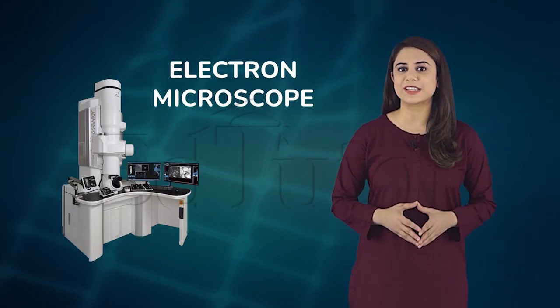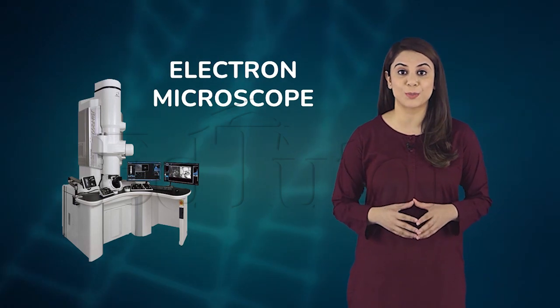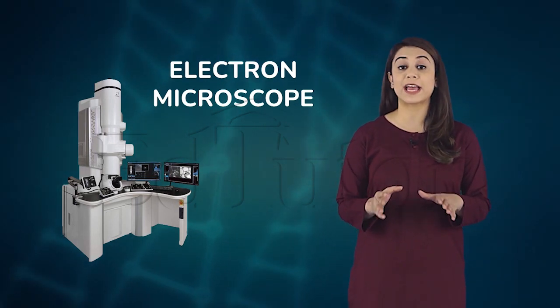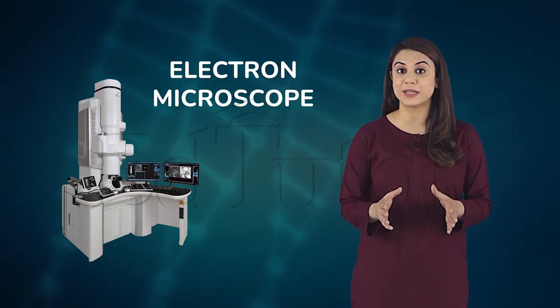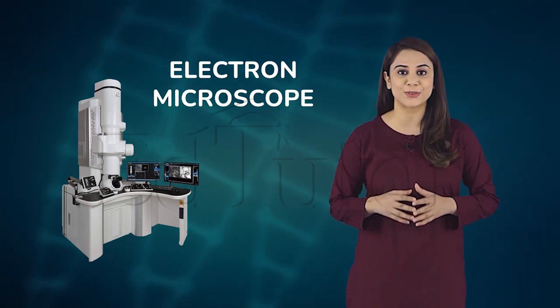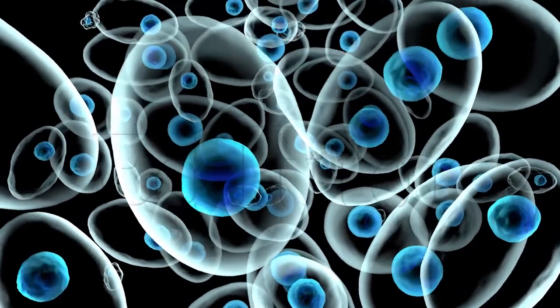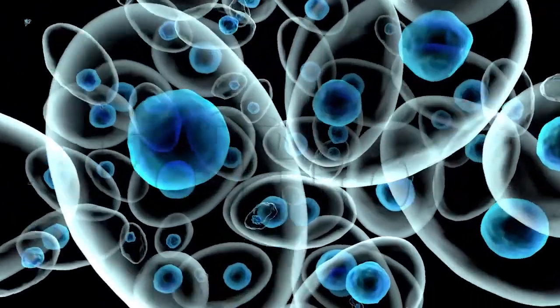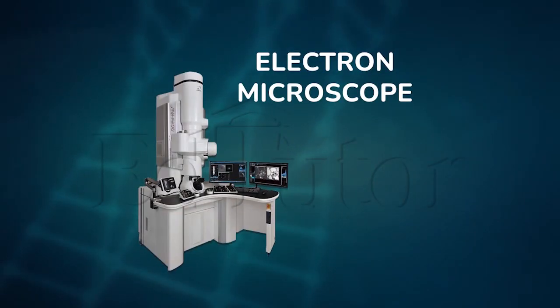So, in the previous lesson, we discussed how great the electron microscope is. But everything has some limitations. And we are going to have a look at the limitations of an electron microscope now. So let's say I want to observe the life processes in a cell. But the problem here is that I cannot use an electron microscope to do this.